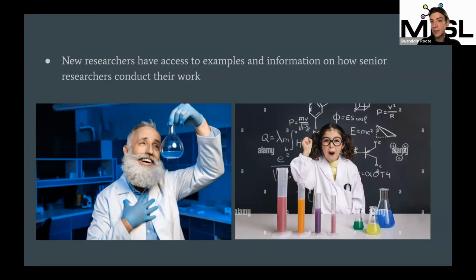So having examples right in front of you for things like lab notebooks, having examples of what information I need to include when I'm creating a sample that I want to put into storage is really helpful for our new researchers. And I think it's great.